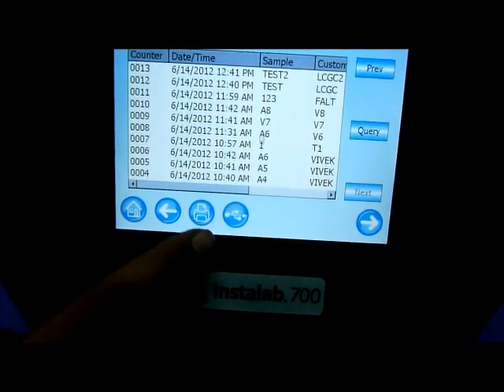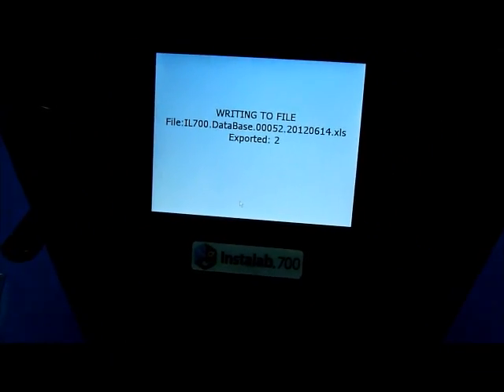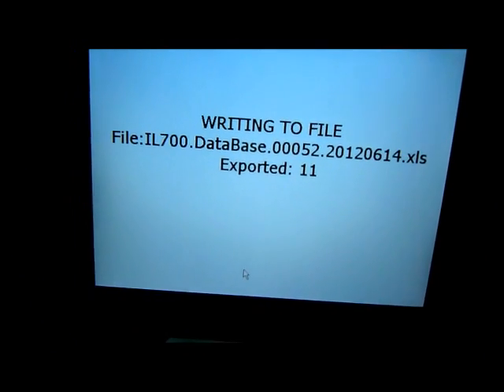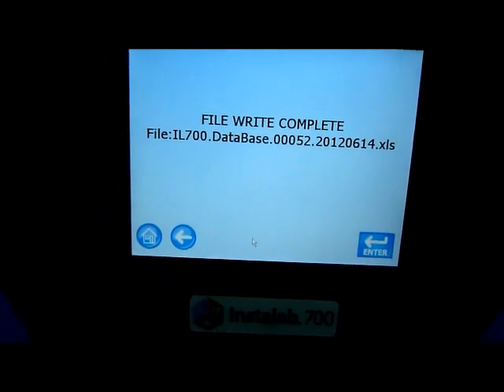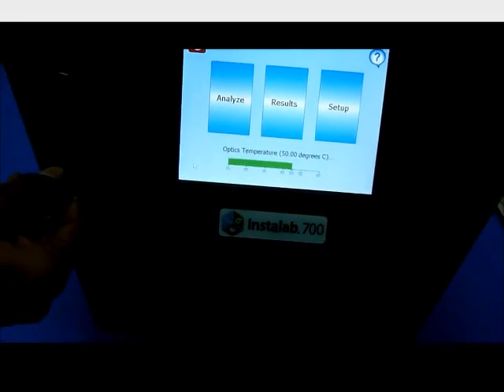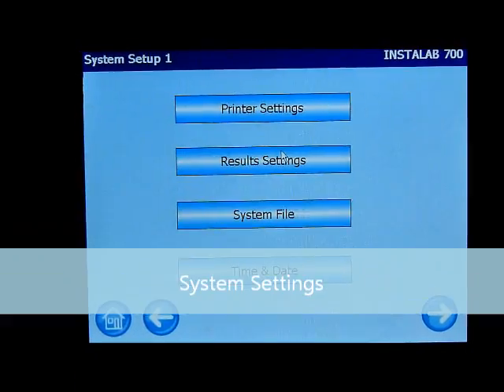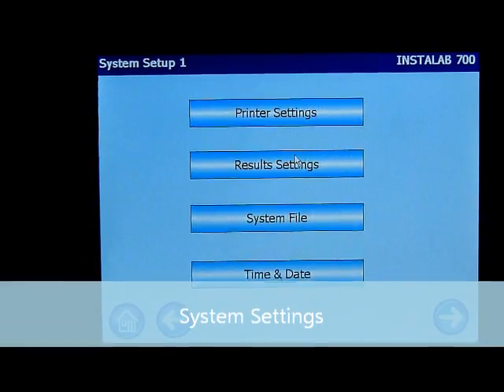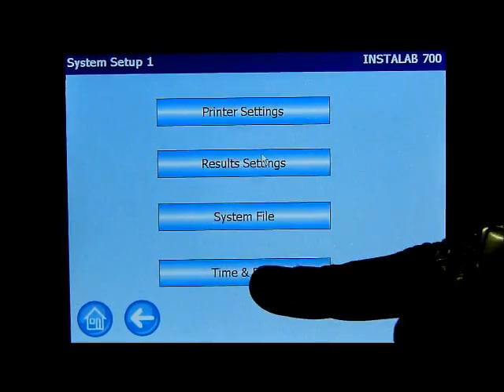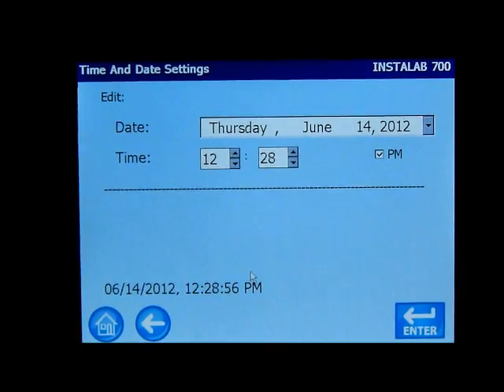We now need to enter the sample ID and the customer ID. A keyboard can be connected to the system. You can see the results are being displayed within seconds. You can also export the results to a pen drive. The results are exported in Excel format.